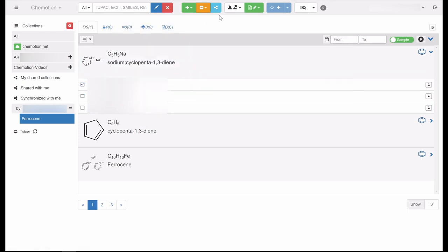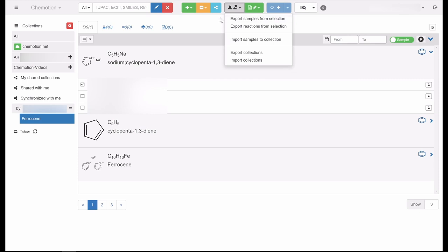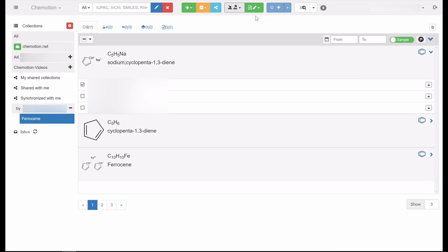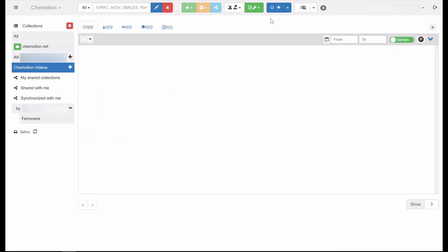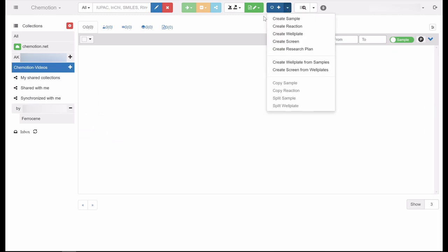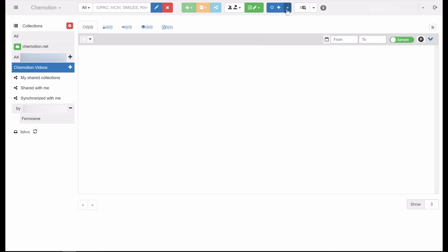Furthermore, you can access options for the import and export of data via the white button. The green tab lets you generate a report. With the help of the blue button, you can add items such as samples, reactions, or research plans to the current collection. The last tab provides options to generate labels for selected elements.